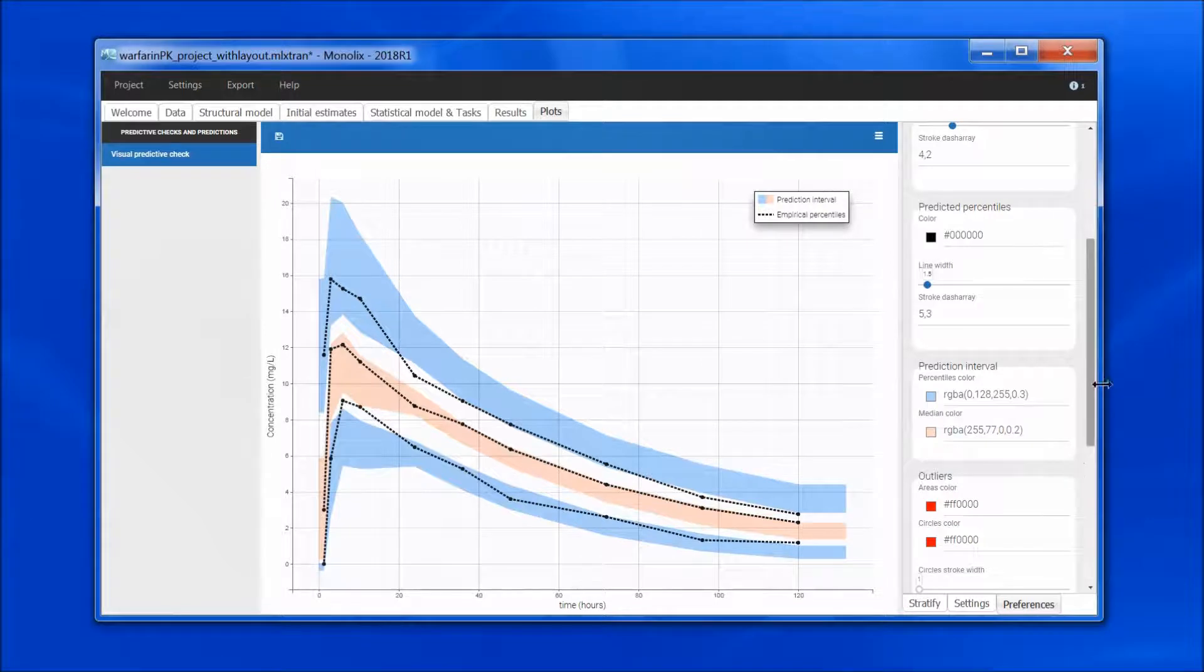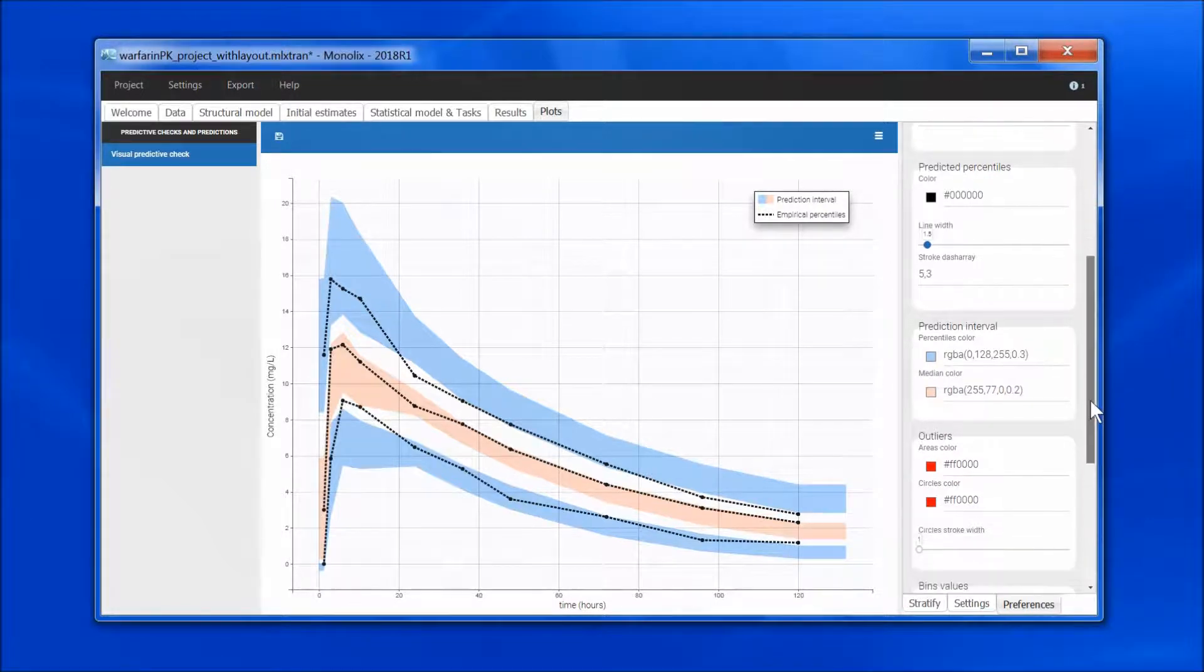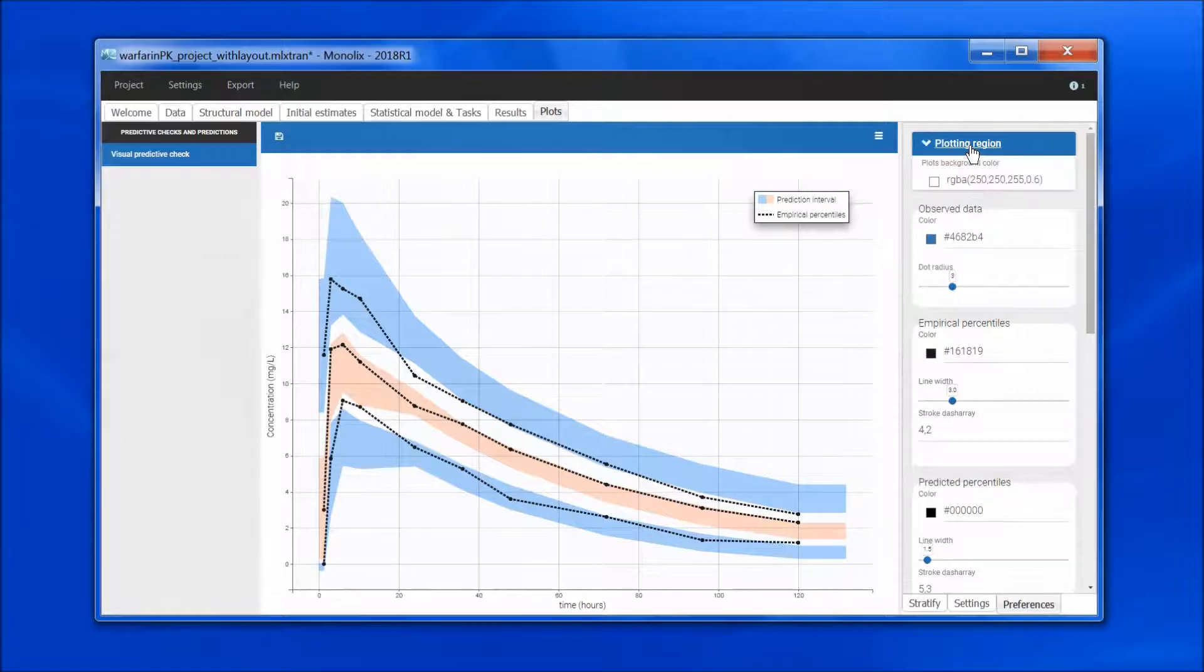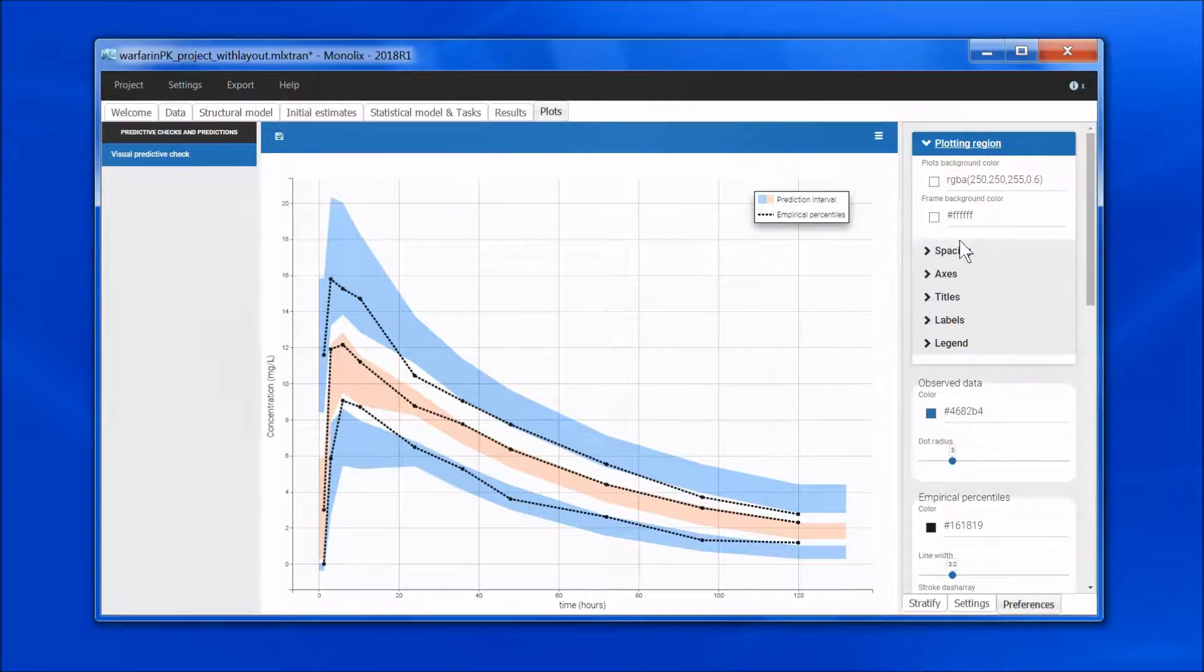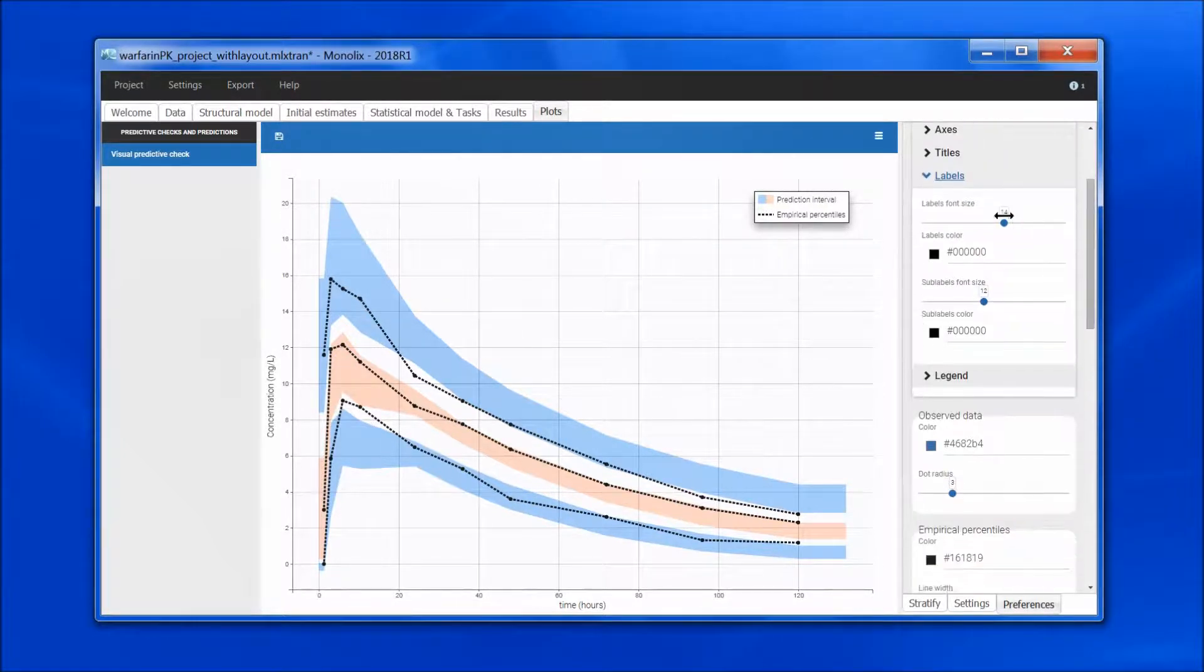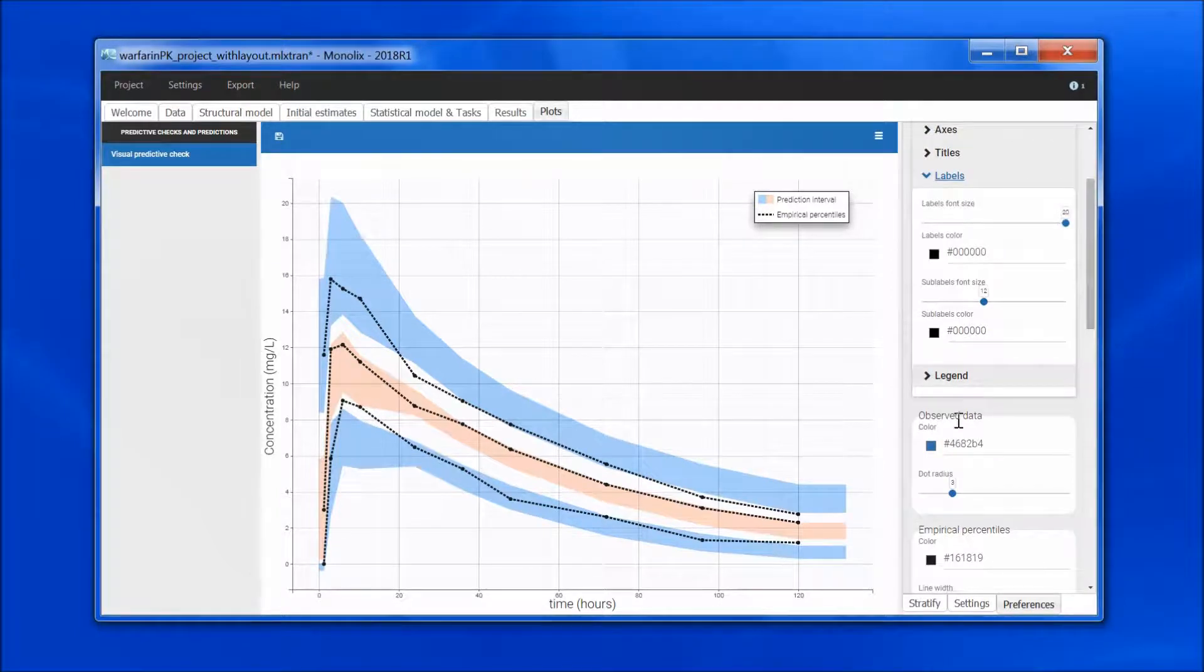I also find that the labels are too small. For this, I will go into the plotting region, labels, and here I can choose to increase the font size to 20 for instance.